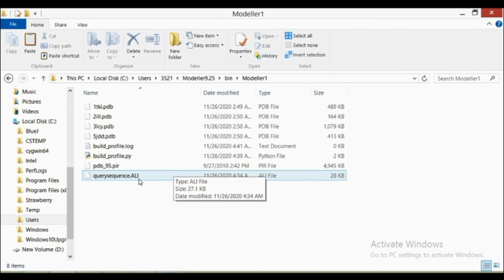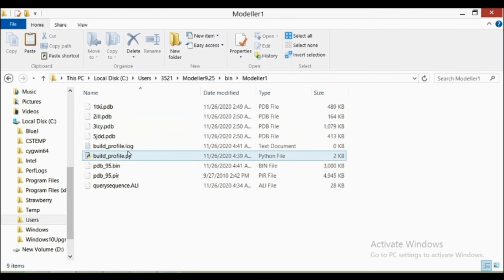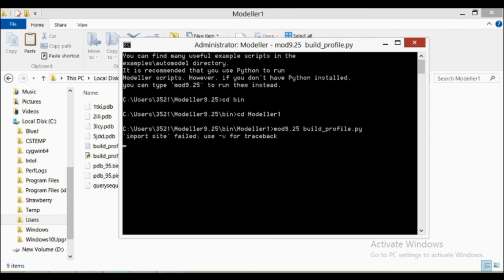There are multiple other scripts as well that we will use for the analysis, and by the end of running all these 3-4 commands of the 4 scripts, we will have the structures, and we will also evaluate those structures. The protein amino acid sequence was also very large, around 26,000 amino acids, so it will take a bit of time.